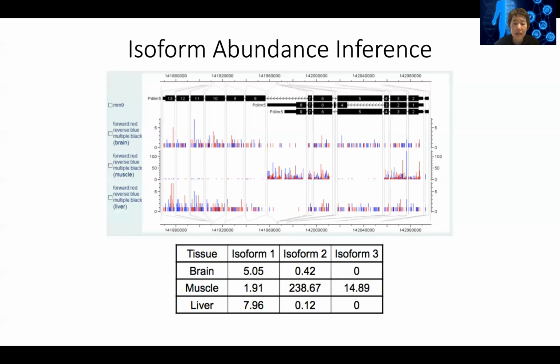And so occasionally, the maximum likelihood will give you the best estimate to fit the data, but it may not really match perfectly. And usually that is because our knowledge of the existing transcripts may not be complete. Maybe there's a hidden transcript that we didn't know about, and it's contributing reads that are not explainable with the current annotation.